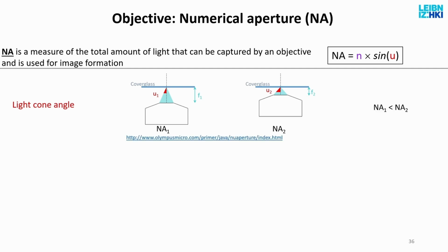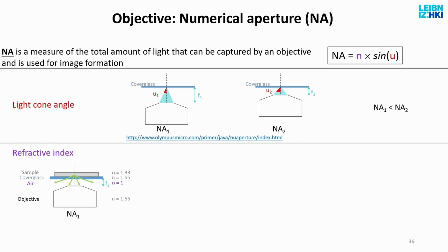On the other hand, I can also play with the liquid that I put between the lens and the cover glass. I can put nothing there, just leave air, which means that in simple geometrical optics, the refractive index will determine what part of the beam that comes from the sample after, for example, fluorescence excitation enters the lens.